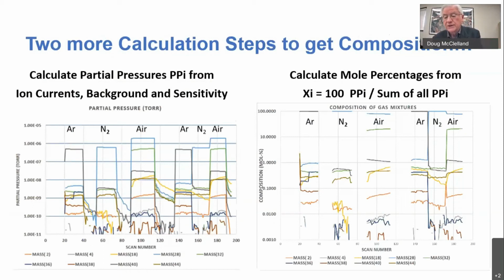from Doug's system. And here you can see argon is mainly high purity argon, and then the blue color is for the high purity nitrogen. And then with air, the nitrogen goes from being 100% down to 78% with 20.9% oxygen in it, about 1% of argon. And then here the yellow is water vapor that creeps in as we introduce wet air compared to the lower water vapor in the previous N2 that is there.